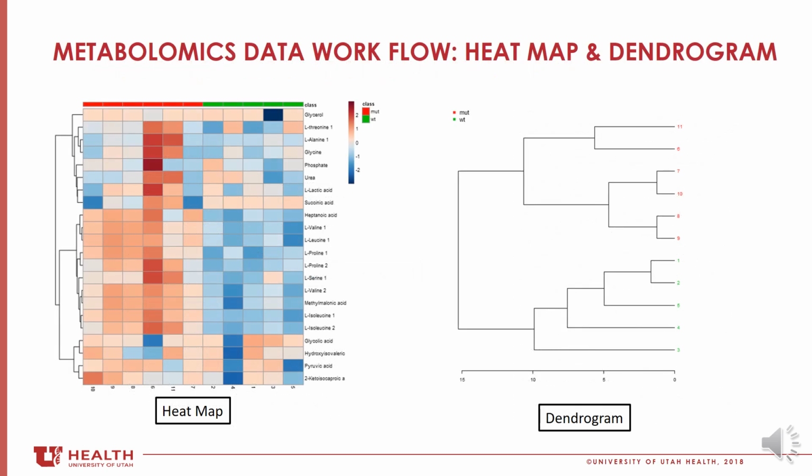So this is further down the report. What we do is we compare your samples and whatever comparisons you ask us to do in the Reporterator, or you can do this in MetaboAnalyst yourself. We make heat maps, and we also can do dendrograms, shown here on the right-hand side. And these make for really nice pictures, but they really don't tell us too much about the metabolites that are altered that change and allows for groupings.